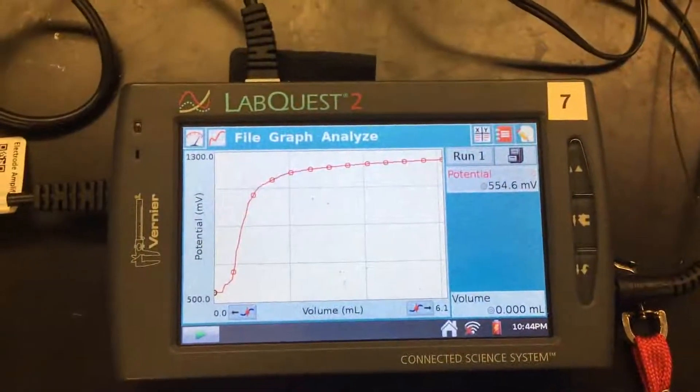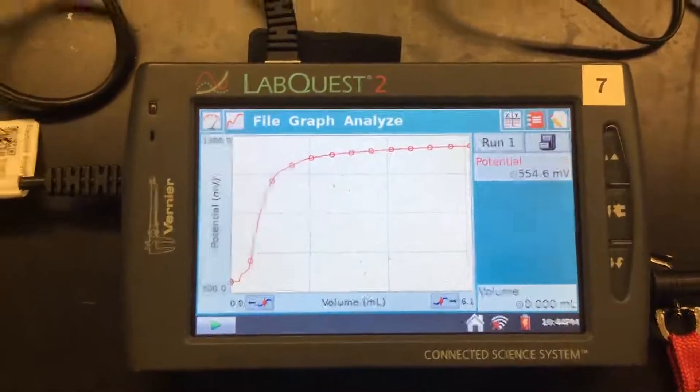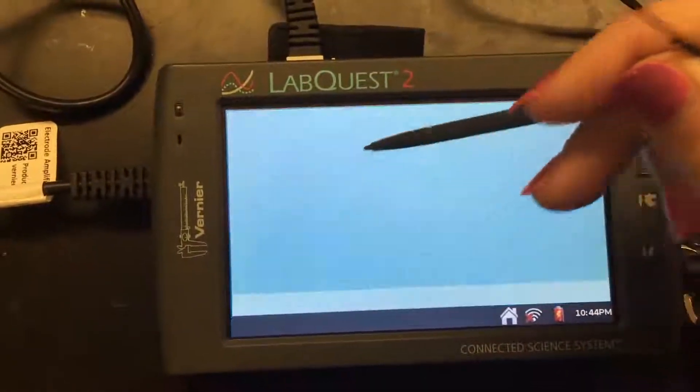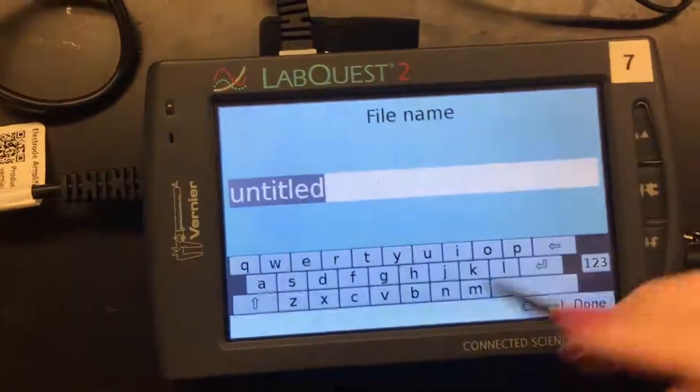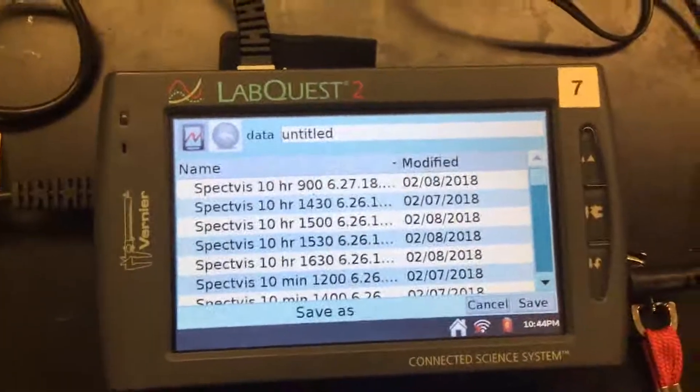So this is what the graph looked like in the end. So it reached the equivalence point. So now what we're going to do is we want to save it. So then we're going to click file, save, and then whatever title you want, and just click the box. And then you can type in whatever you want, and then click done, and then click save. And that's it.